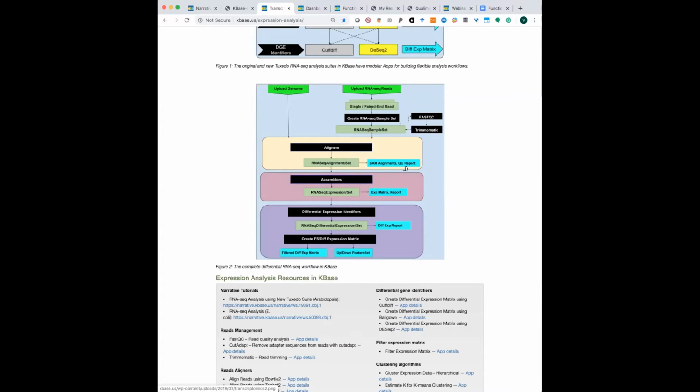So one of the things that I like to point out is that we do extensive QC throughout the pipeline. And then we have taken a lot of pain to embed a lot of QC tools. So even when you see the StringTie or FastQC, we actually have embedded additional tools in addition to HISAT2 itself, tools like QualiMap, for example, for alignment, or obviously tools like FastQC and other trimming tools.